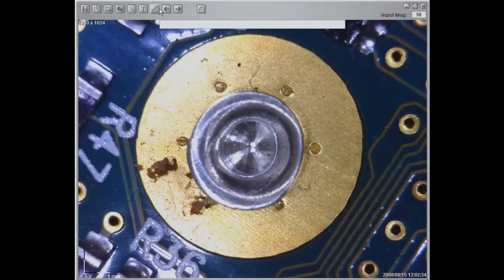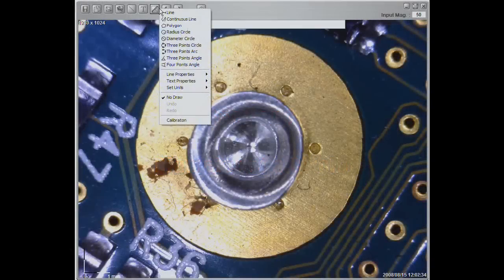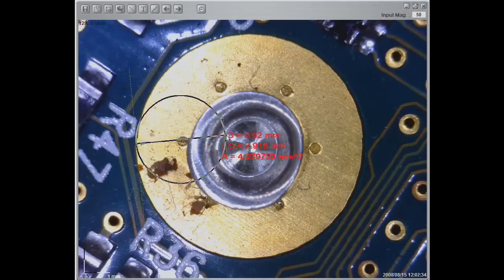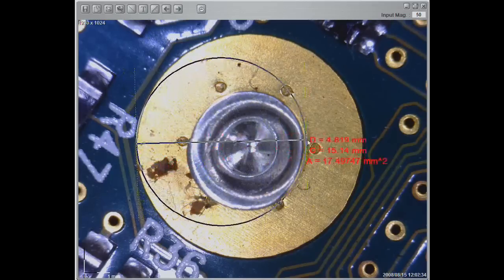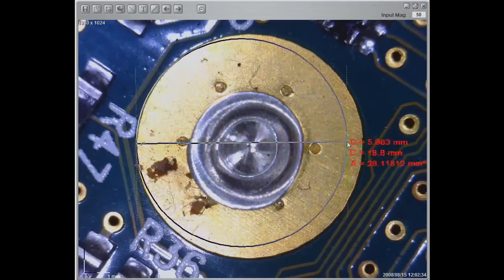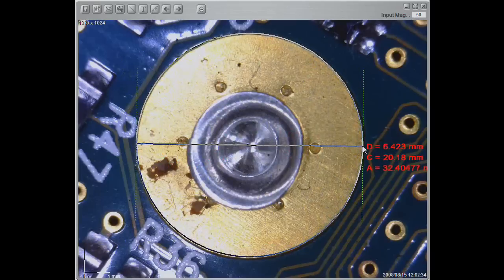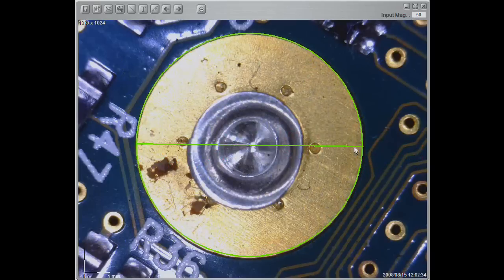Select diameter circle to start measuring the diameter of a circle. Left click for the beginning point, left click again for the ending point, then place the results where you would like it.